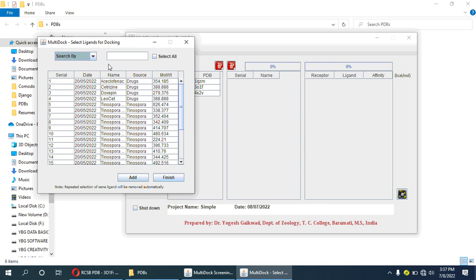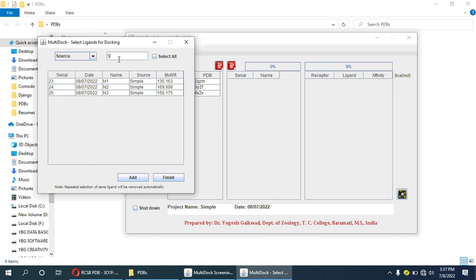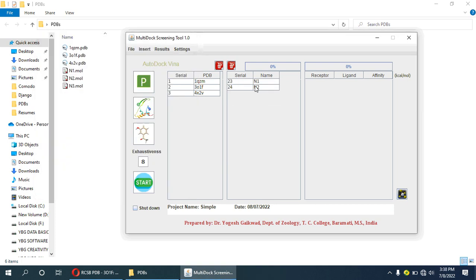I will select those ligand molecules and name the source as 'simple molecules'. For demo purposes I will select only two molecules — n1 and n2. These two molecules are now selected for docking. I will adjust the exhaustiveness to 10, and by clicking the Start button we can start the docking process.